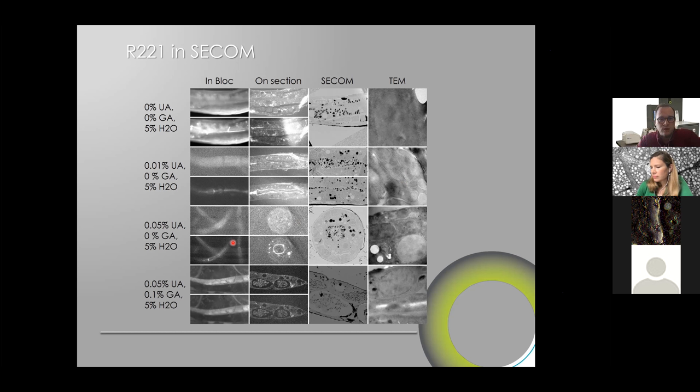0.1% is not much better in the SEM than 0.05%. Again, this is very empirical observation, and I do not quantify that. I don't know how to quantify it, to be completely honest, but that would be most likely interesting in the long term. And the glutaraldehyde, to some extent, also increases the contrast.